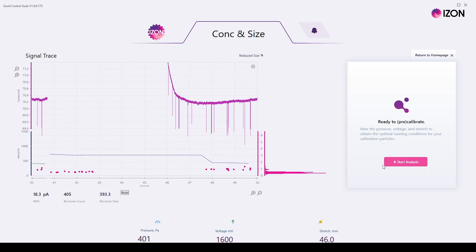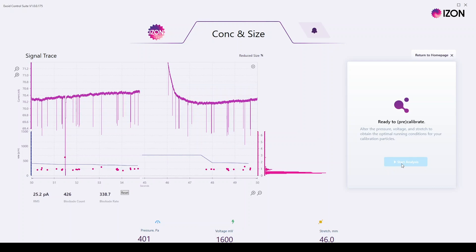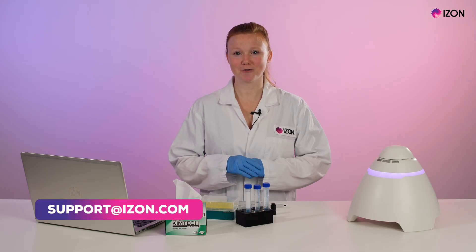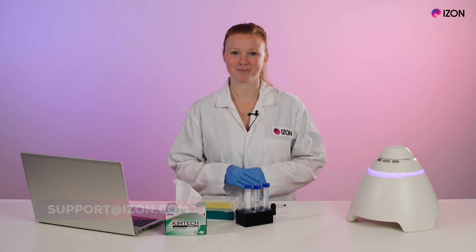While we advise beginners to take measurements at parameters that result in a baseline of 100 to 140 nanoamps to get the best data, once you have a good understanding of what to look for and how to tune your parameters to the sample you have, you will be able to identify and work at the parameters best suited for your sample. Please contact us at support.izon.com for more information or if you have any questions. Thank you.